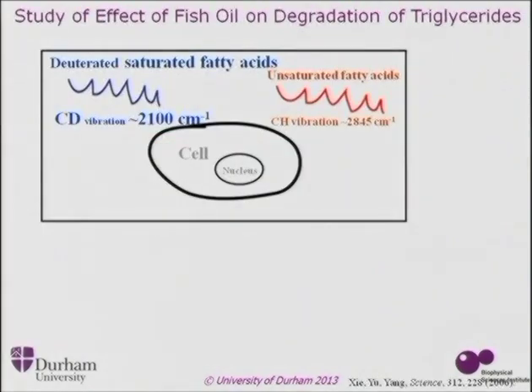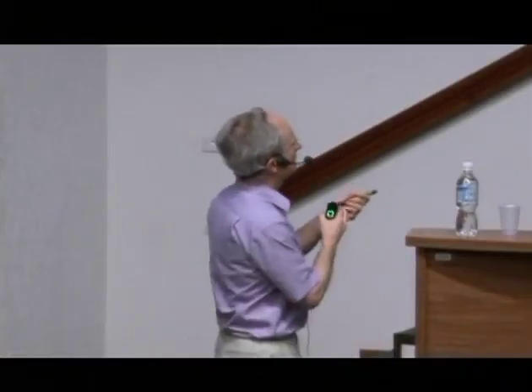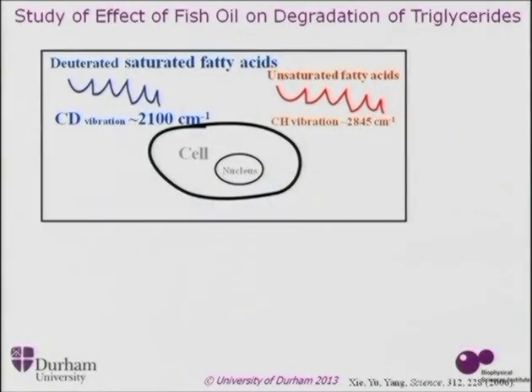You can actually be specific. You can label things slightly. So, for example, if you replace the hydrogen with deuterium, the frequency of the vibration is slightly different. We've added some weight to it, so it's going to vibrate at a different frequency.